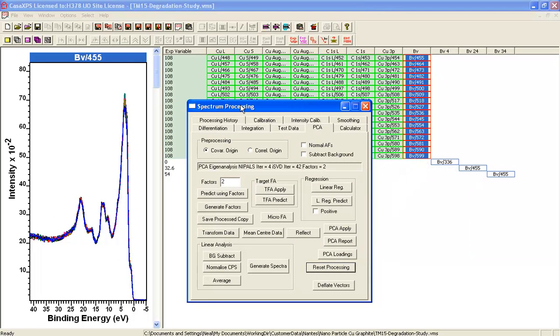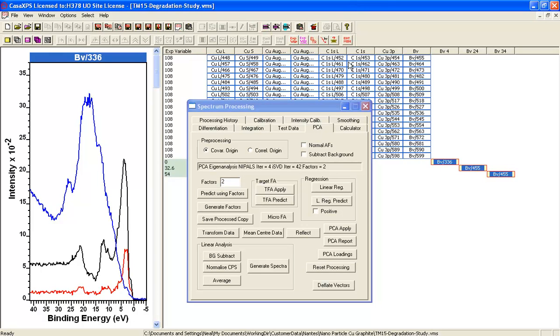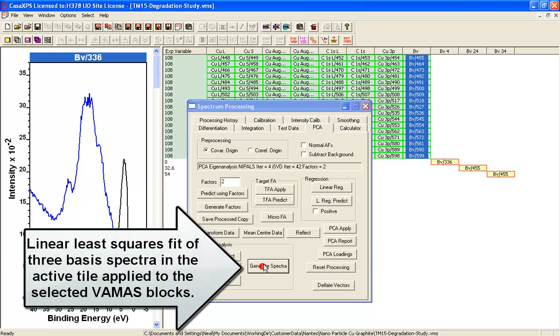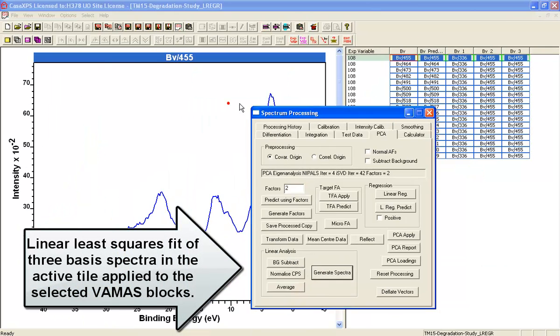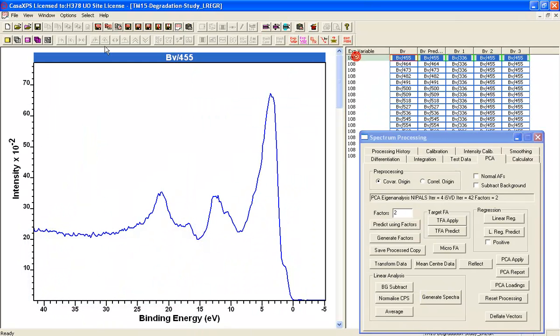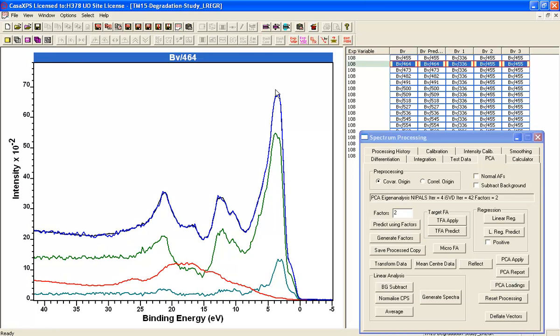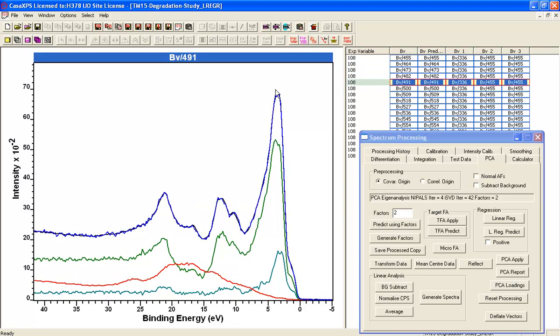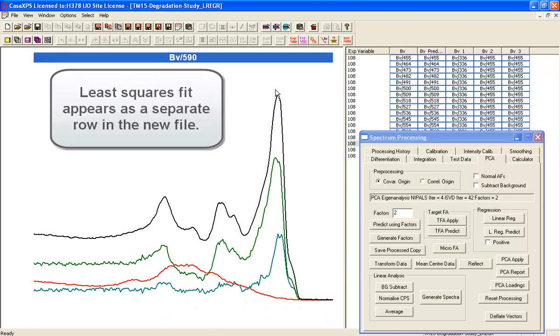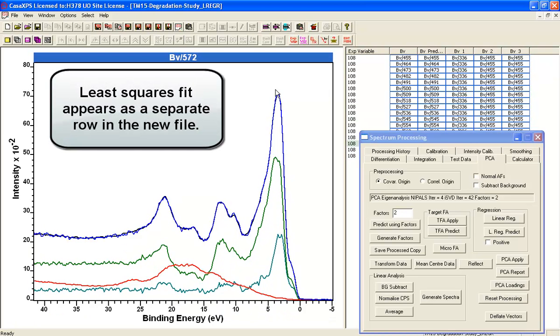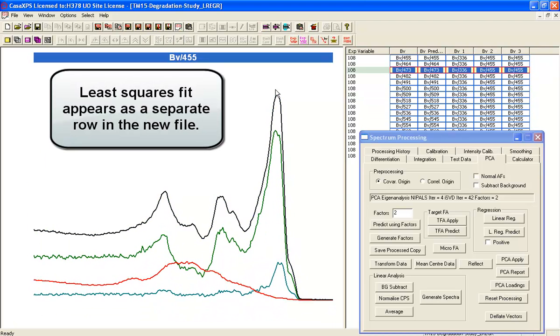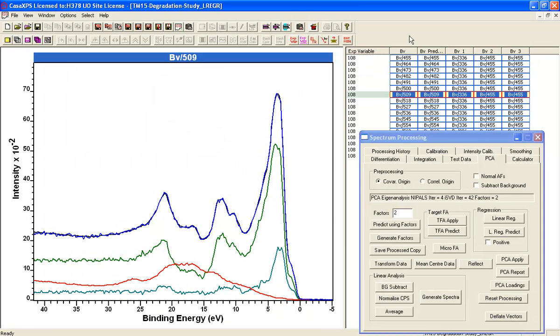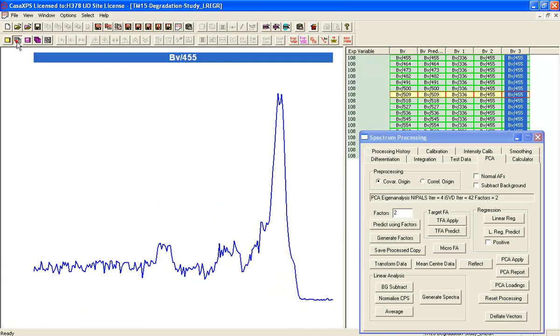We need to overlay in the active tile the three basis functions. Then we're going to select the functions to which we want to do a fit and generate spectra. Now we've got a file that contains in each row the least squares solution. We can step up and down this and you can now see that these three shapes when combined in a linear least squares sense reproduce the entire data set. That's quite reassuring.